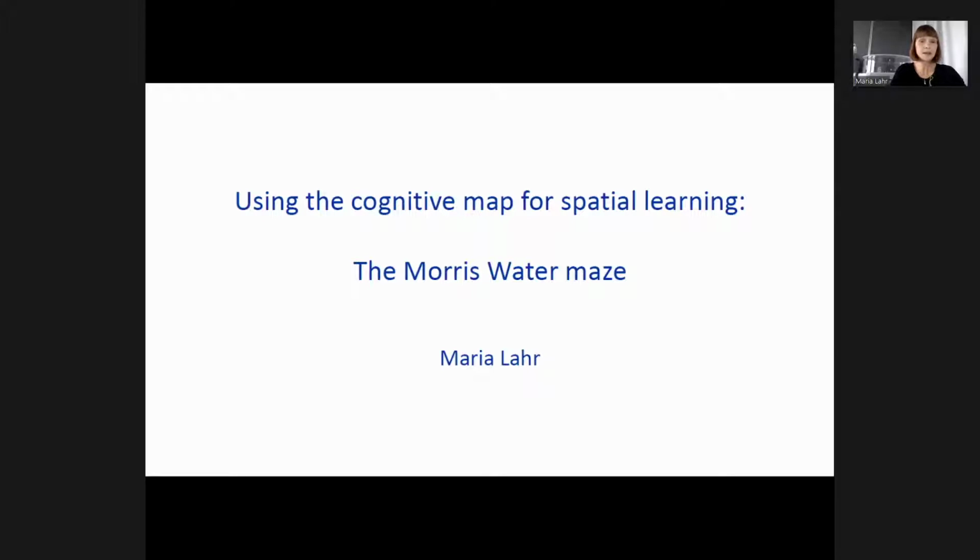And the idea now is that I tell you a few principles about how the water maze works. Then I will show you the software that we use to design the task and to analyze it. This software is called EthoVision, and you just have to watch it, because for me it will be very practical. I will show you exactly how we design everything.